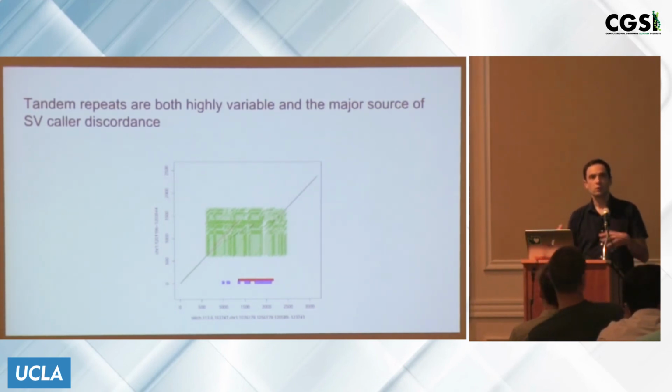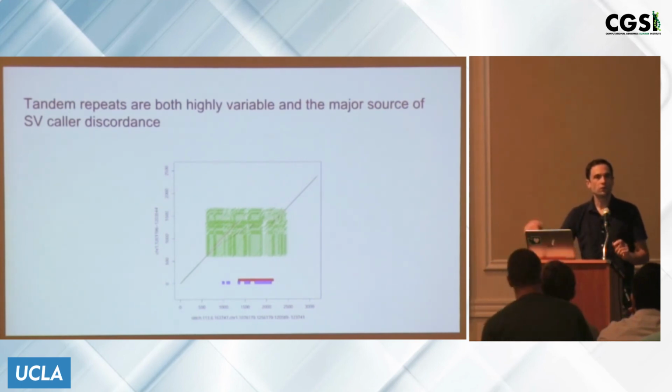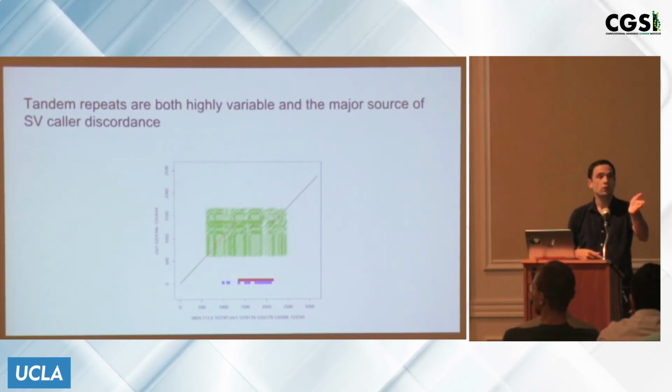In my mind, it seems an easier problem to look at some sort of consensus between the single molecule sequencing reads first, and then maybe look for additional support from Illumina sequences later. But people have definitely shown an improvement over simple single molecule sequences. There should be a mathematical distinction.